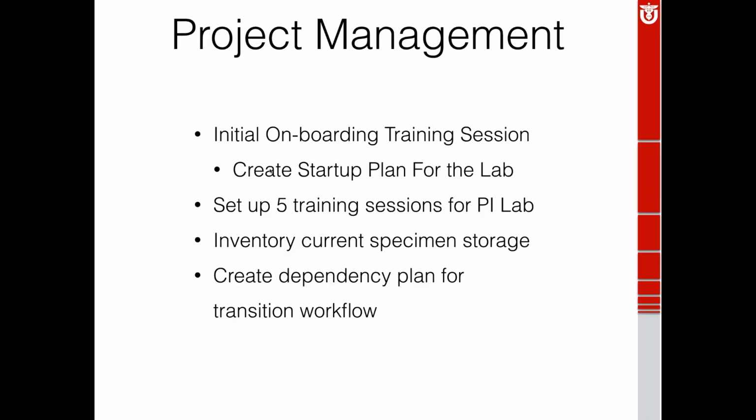We're hoping to get that built up into a self-sustaining process where we can have Kershagney jump in, get things kick-started, and we'll have enough material built up that we can work through each lab a little more quickly. Once that's happened, we get them set up so they can do new samples coming in the door, and then we start working, as a secondary process, on the inventory of their current specimen storage and a dependency plan for a transition workflow for their older samples that are already in their systems.